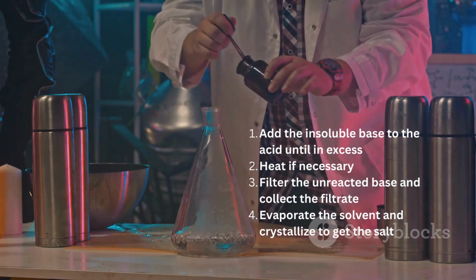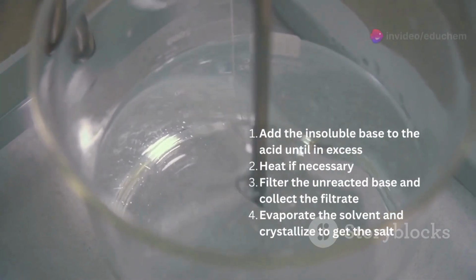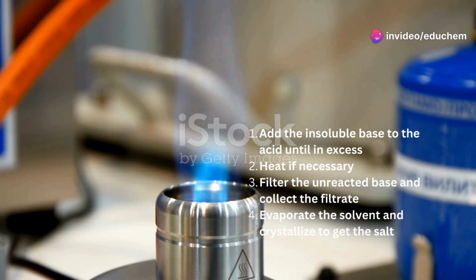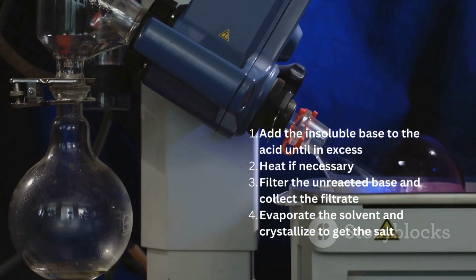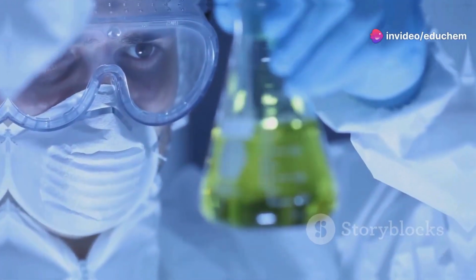Add the insoluble base to the acid. Stir the mixture until the base has reacted completely and excess base remains undissolved in the mixture. Heat may be required to ensure the reaction is complete. Filter the solution to remove any unreacted base and collect the filtrate. Evaporate the solution to crystallize the salt. Dry the crystals to obtain the pure salt.